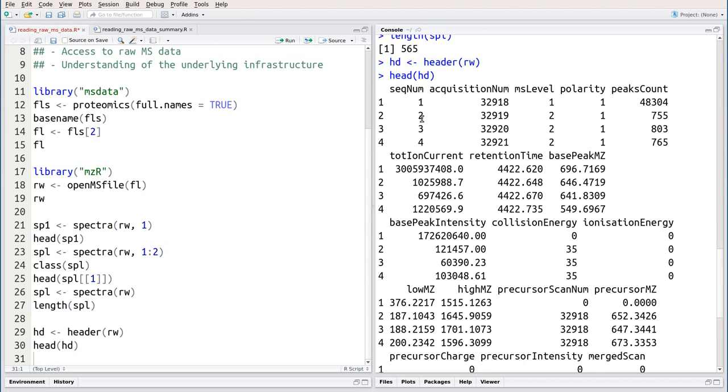For instance, the sequence number from 1 to 565, the acquisition number in the original file, the MS level, polarity, peaks count, and so on.